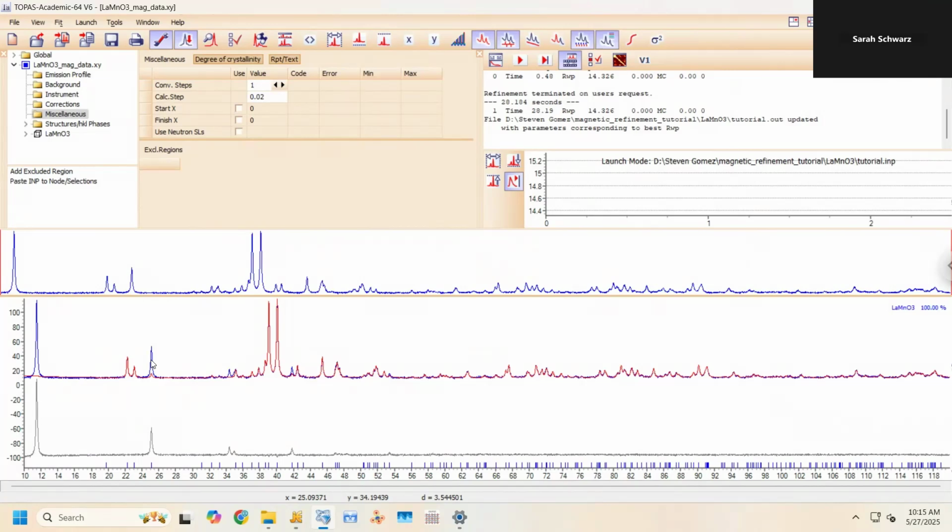Okay. Yeah. It also depends on the instrument, right? Depending on how your instrument's working, it might give you a different peak shape that might be more similar to Lorentzian or more similar to a Gaussian. Who knows? Why that is sort of beyond me.